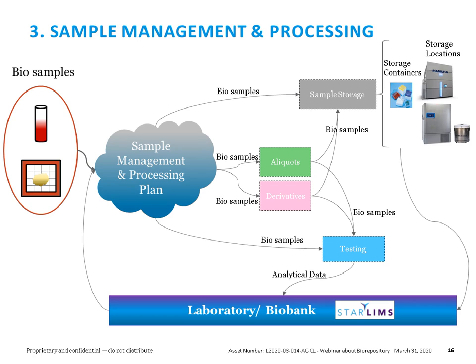We need to collect analytical data, right? And in some cases, we are also going to receive the samples already as they are, the way we're getting them. Perhaps those containers are coming ready to be tested, so no aliquots, no derivatives need to be created. So we need to also account for that scenario. So having the LIMS telling the user all of these reminders and cues, telling them what needs to happen next to the samples as soon as they are received, is important.